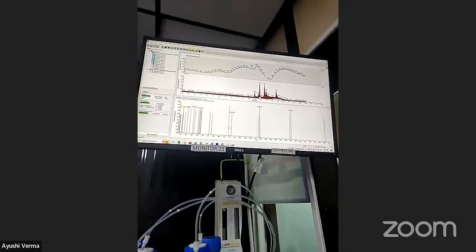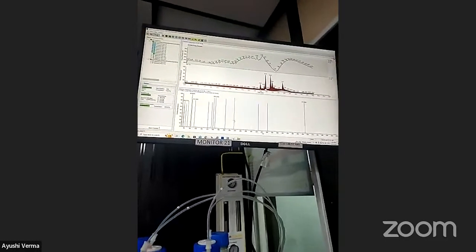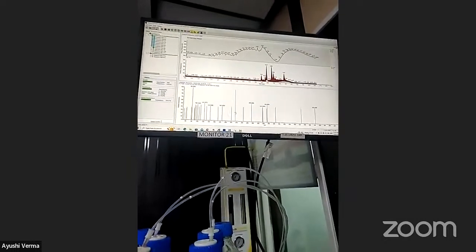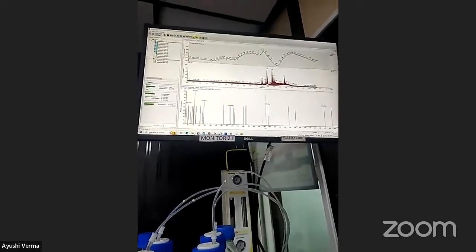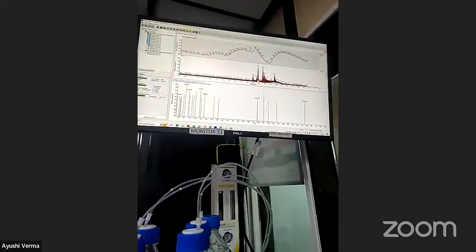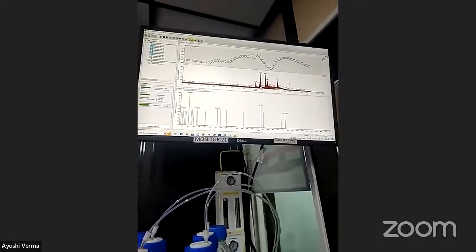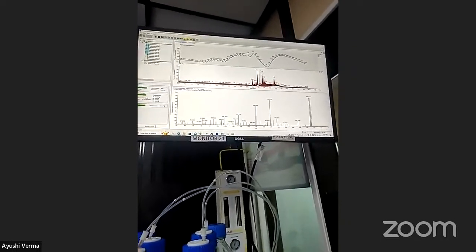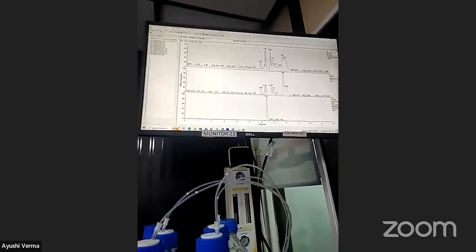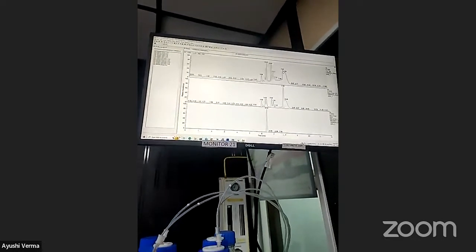One thing that needs to be understood is that metabolites can be identified at the MS1 level with the compound molecular weight, but the same molecular weight can belong to different compounds. For this reason, we need to check the MS2 to match with the known compound. That particular compound will have a unique fragmentation spectrum. This is the run going on with the chromatogram on the basis of the gradient. The particular compounds are getting analyzed, and here in the runs that have occurred, you can see this is the particular compound that has eluted out.